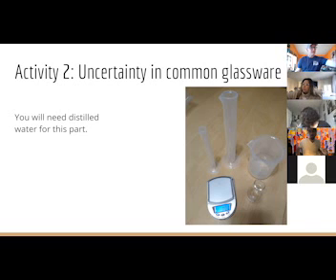Okay. Does everyone find their thermometer? It will be in a square case that looks like this. The thermometer will be inside. It's really small.